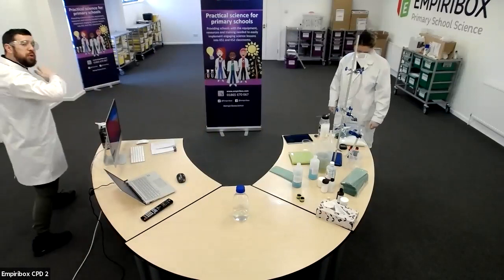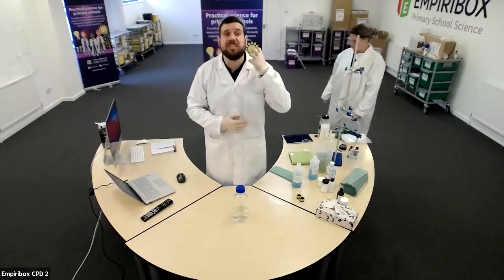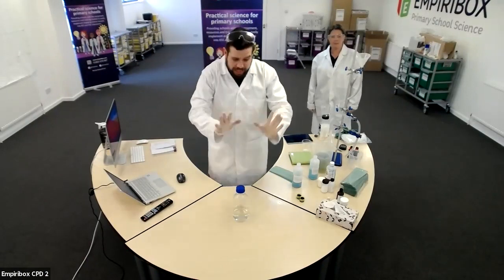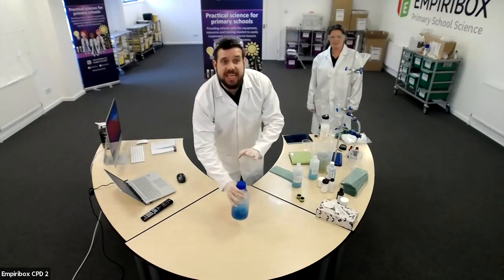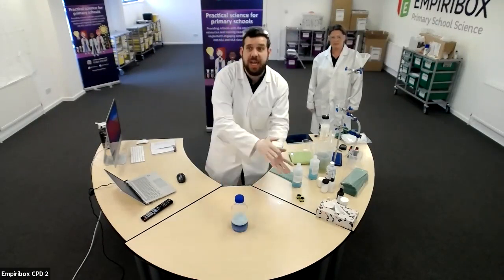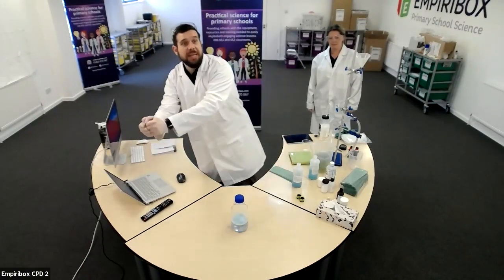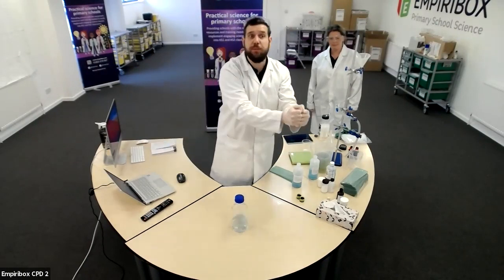Now, the two previous chemical reactions we looked at are called irreversible changes. I know that it is irreversible because I cannot get my substances back. This one on the other side is considered a reversible reaction because you can see it changes color to one side, but then it changes back to clear. So it goes back to its original form.